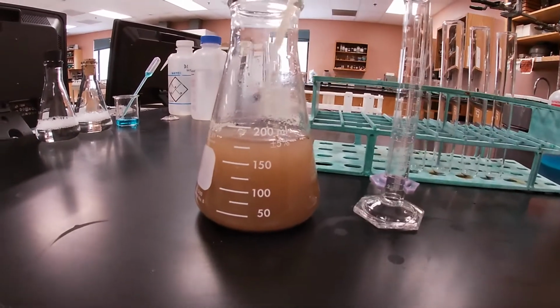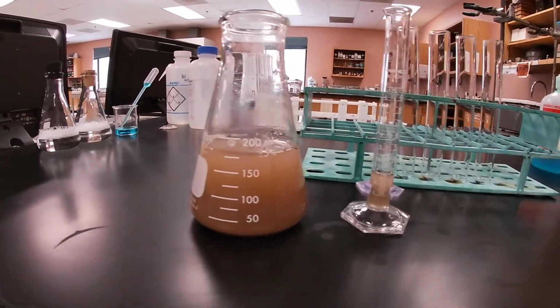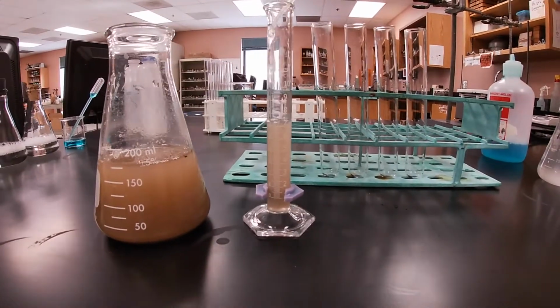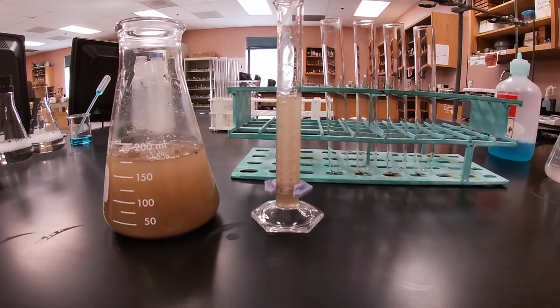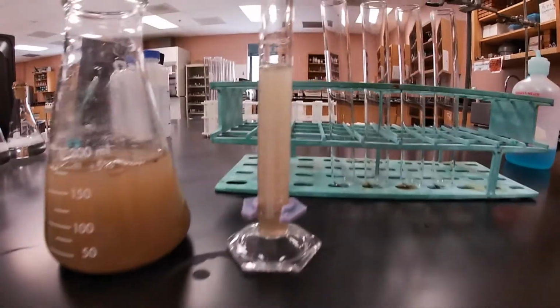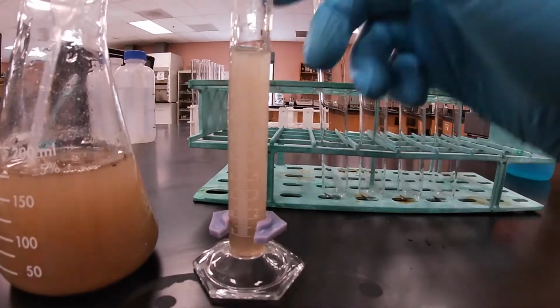So I went already and stirred my muddy water, and we're gonna go ahead and measure out those 10 milliliters of the muddy water. And so here we go, maybe one more, maybe one more. And so we're gonna leave one as our reference. And so, well, maybe a little bit more. And I think that'll be it.